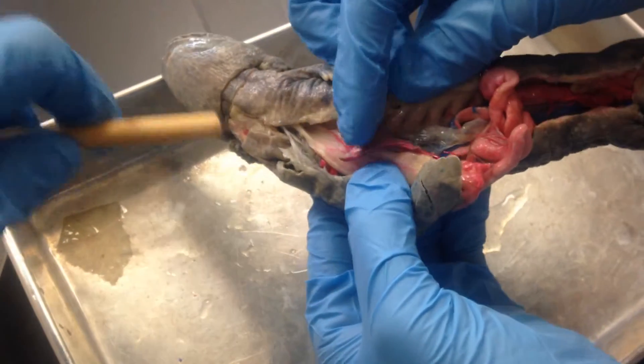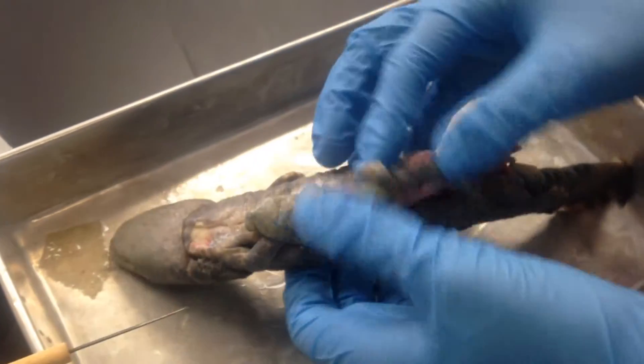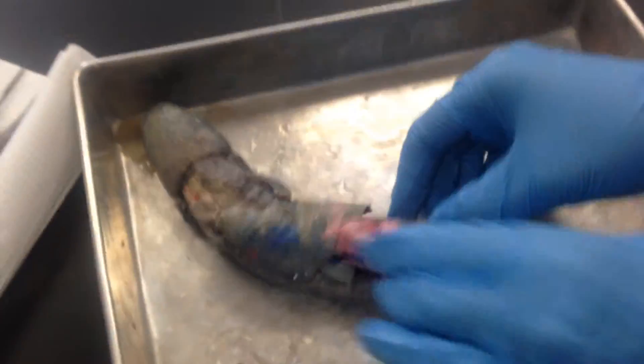On this side you see the spleen — it's always on the left side — and then you have tarsals, those are the other bones that make up your ankle.